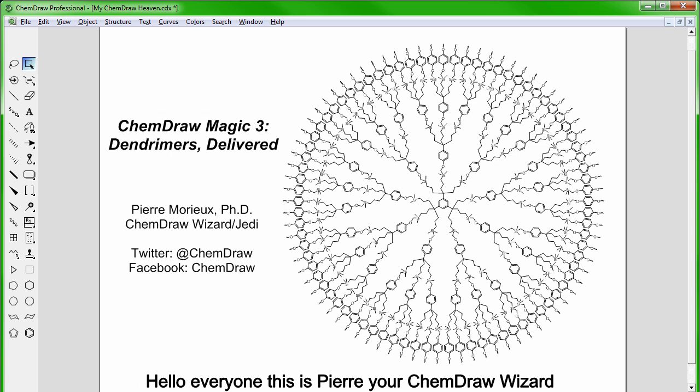Hello everyone, this is Pierre your ChemDraw Wizard, and in this video we're going to see how to draw this nice little structure on the right, under 10 minutes, using multiple tricks available in ChemDraw. Tricks I'm sure you will find helpful, even if your research isn't about dendrimers.